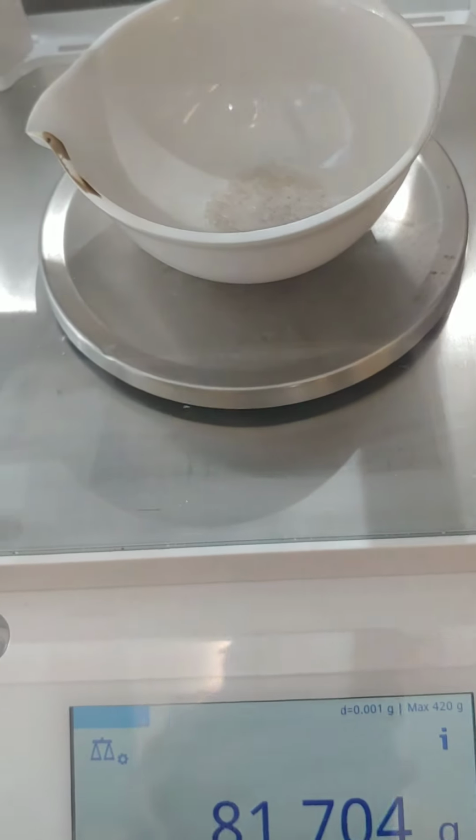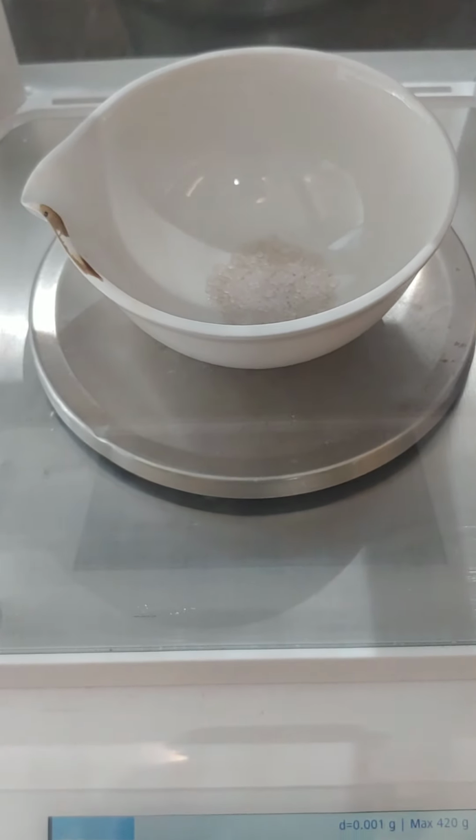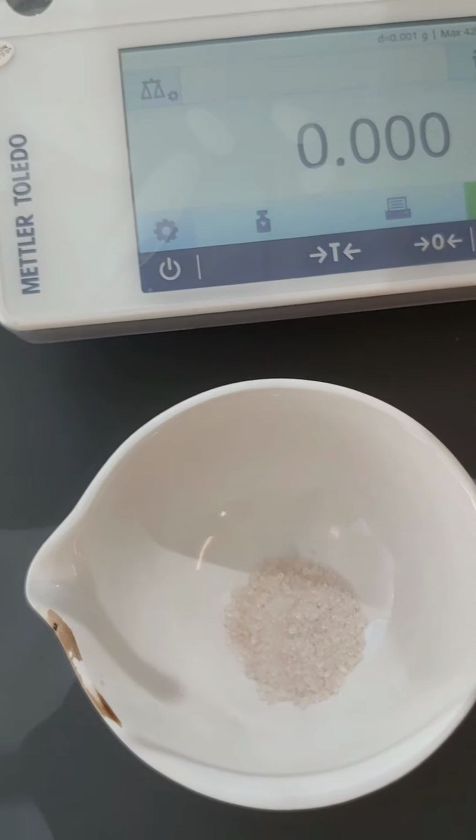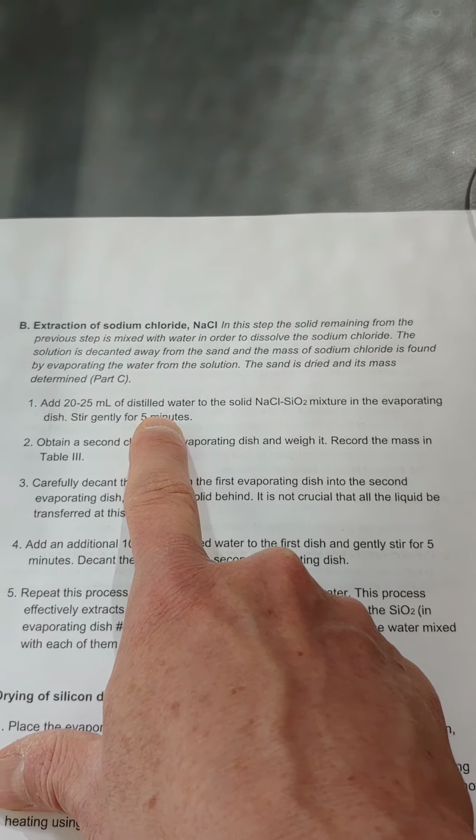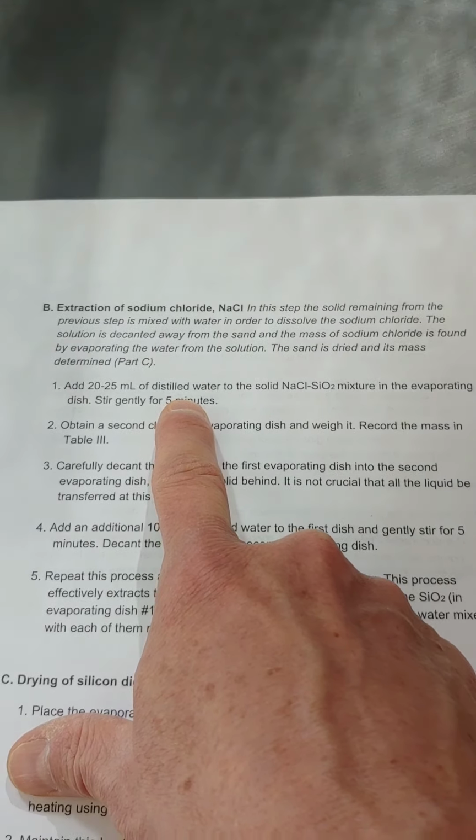Once I'm done with that, I'm going to take this dish that has my sand and sodium chloride in it, and if I look at the next section, now I move on to part B, which is the extraction of the sodium chloride, NaCl. In this step, I've got my sand in there, which does not dissolve in water, and I've got my sodium chloride, which does dissolve in water. So I'm going to go through a rinsing process. I'm going to add 20 to 25 mL of distilled water. Distilled water is water that has had all the minerals removed out of it, because I don't want to be adding any extra substances to it.